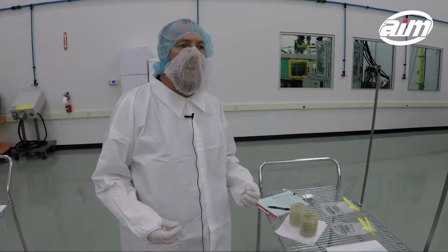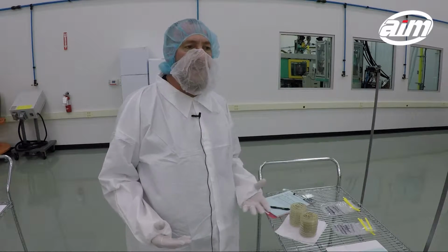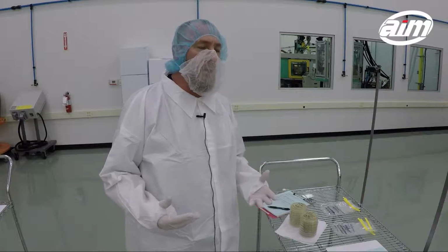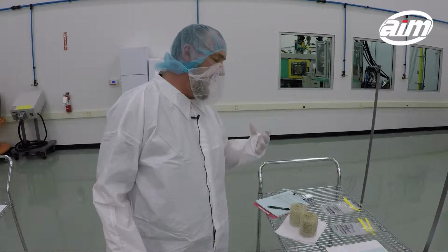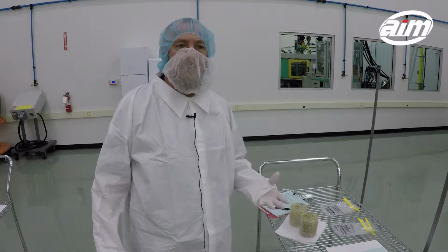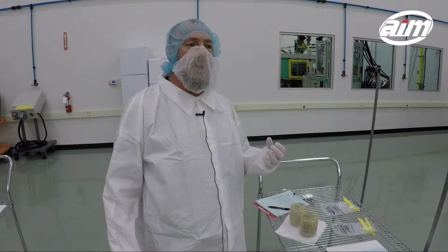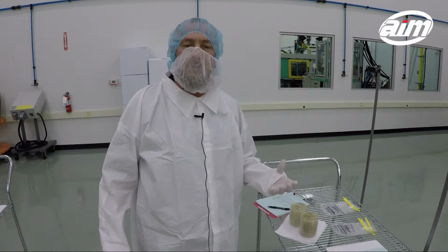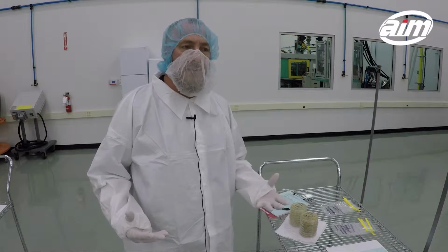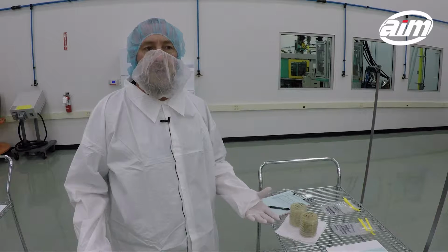We're looking for potential microorganisms in our clean room. We're going to do two types of sampling today. We're going to do what we call a viable sampling for bacterial matter, and then we're also going to do a viable sampling for fungal mold spores. So we're doing two types of collection of samples for different types of organisms in our clean room.